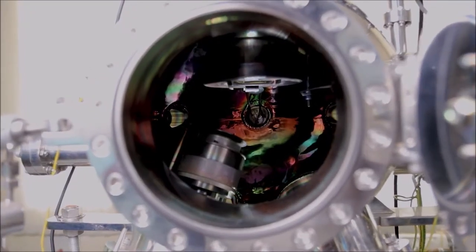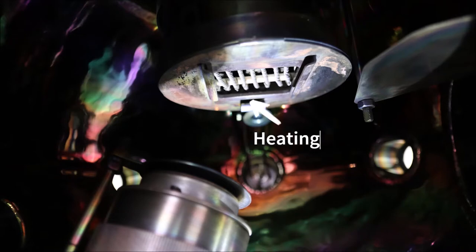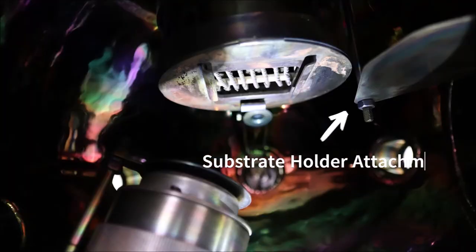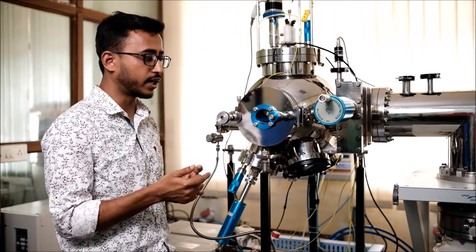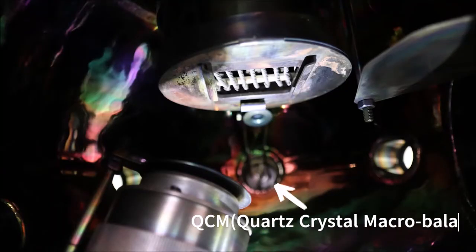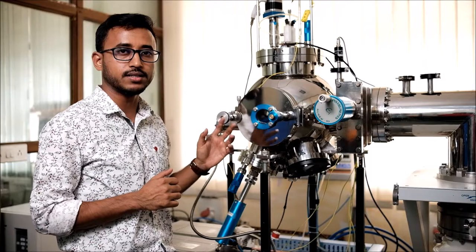Now let's go inside the chamber to understand each part. The string-like structure is the heating coil, responsible for heating. At the bottom of it, the groove you see is where we hold the substrate holder, which also rotates with a controller. At the back of the substrate rotation holder, we see a disc-like structure — this is the quartz crystal microbalance system.